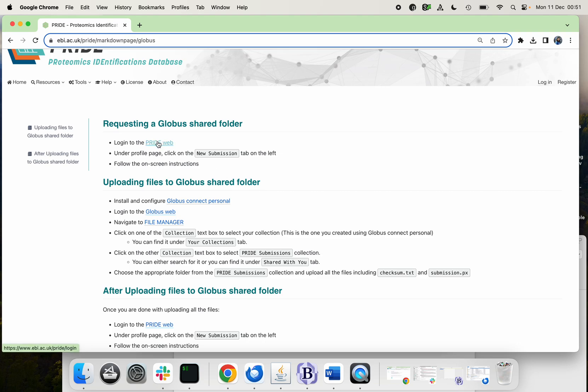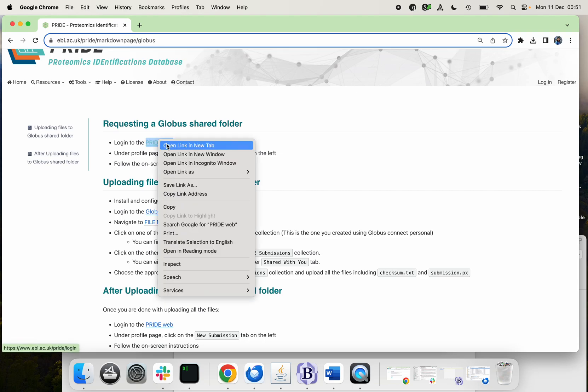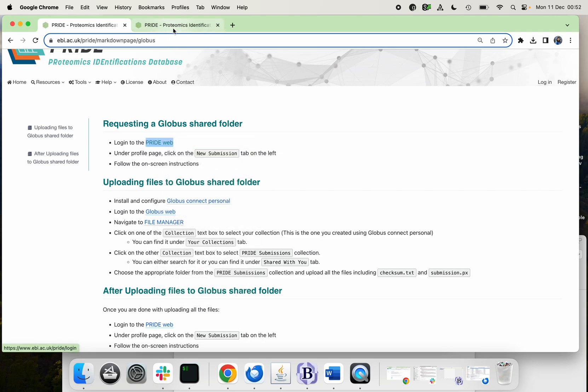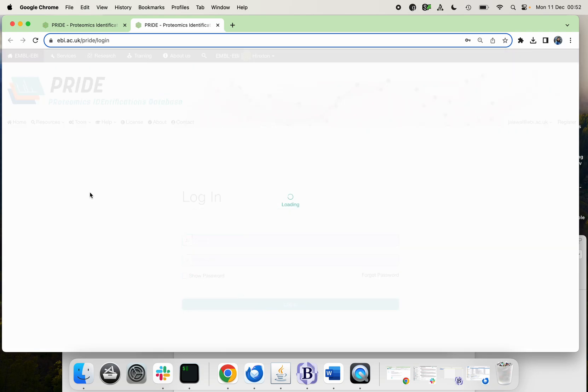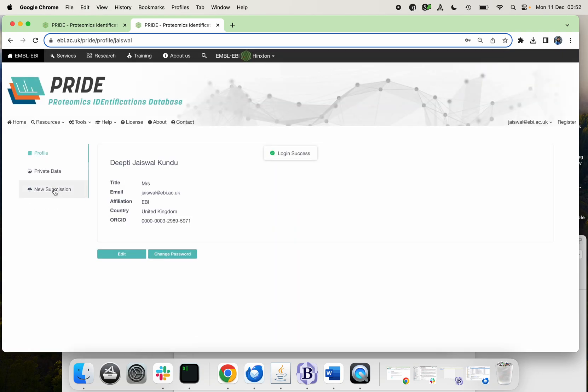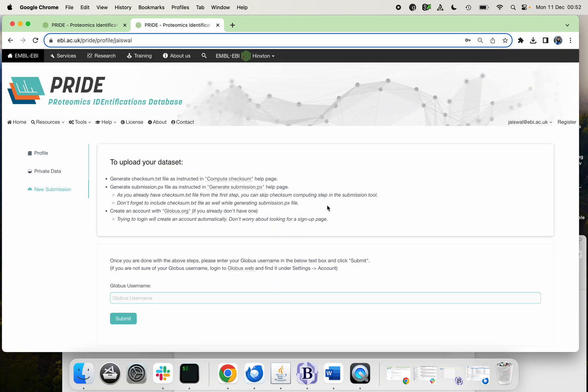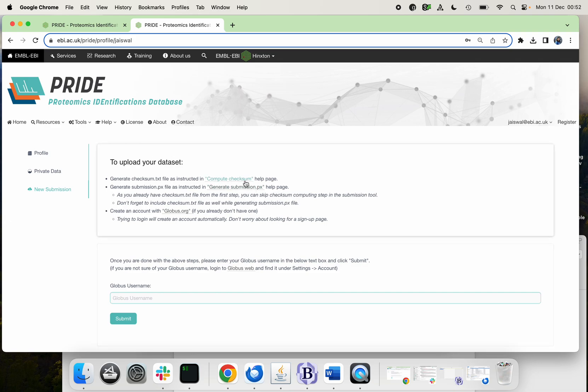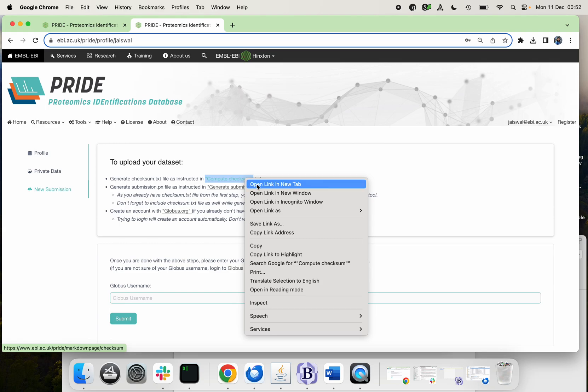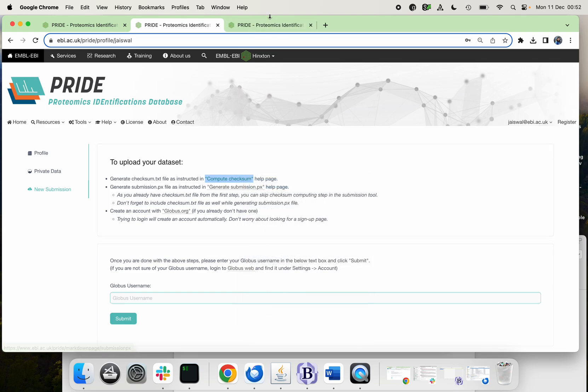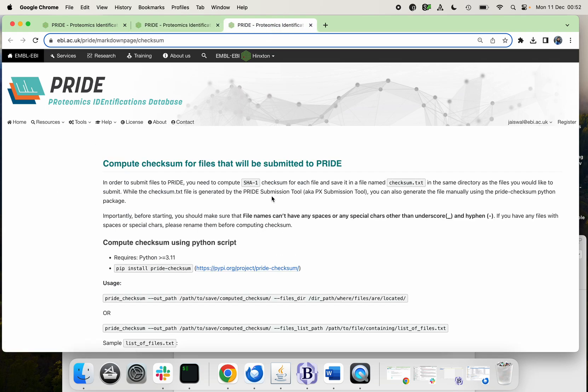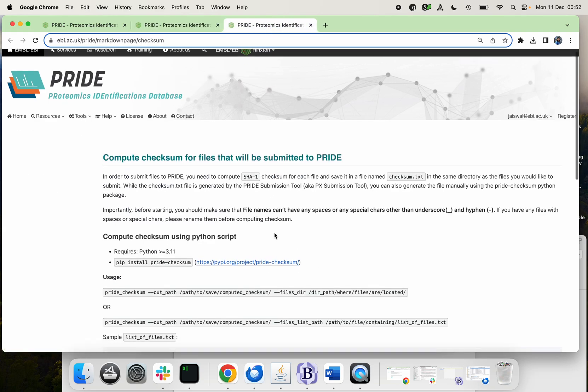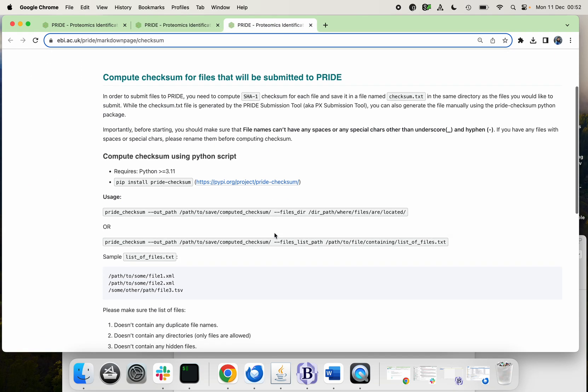Then login to your PRIDE account and select new submission. You can just follow all these steps one by one. The first step is to calculate the checksum of your files, so either you can calculate with the PX submission tool or you can install a Python package which is PRIDE checksum.